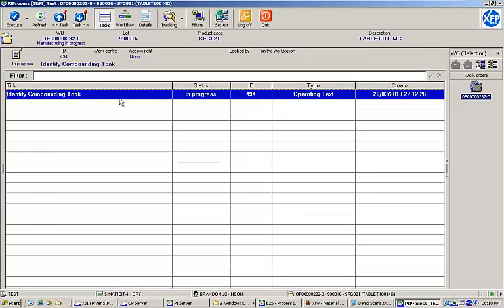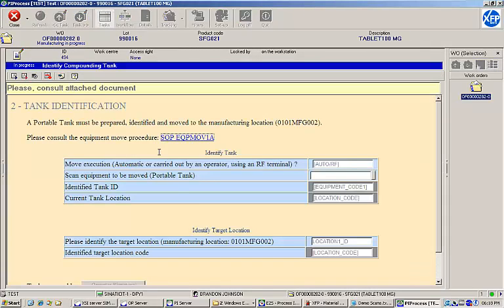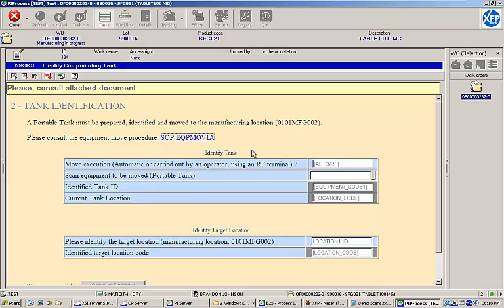Our EBR task list says the next step is to identify a compounding tank. Let's open the task and take a look at the process instructions. Our first step is to consult the equipment move procedure. If we try to move on without reviewing the document, the EBR generates an error message and will not let us proceed. I'll click the link to open the file.